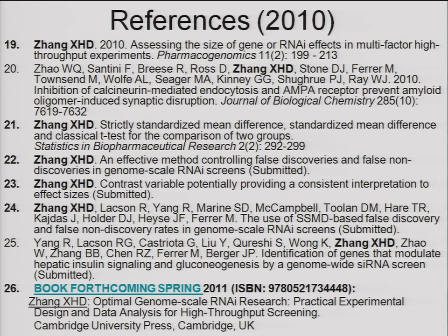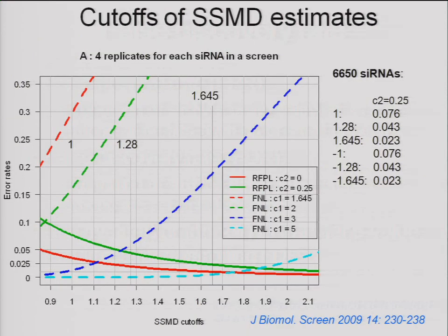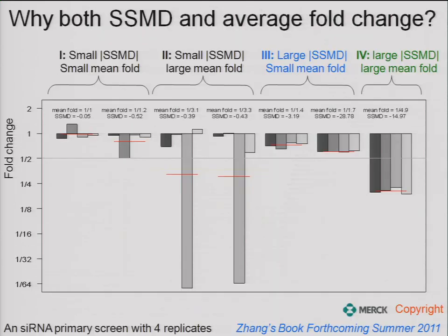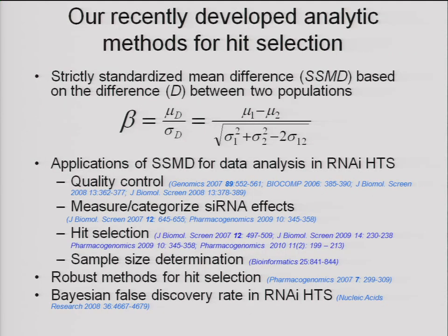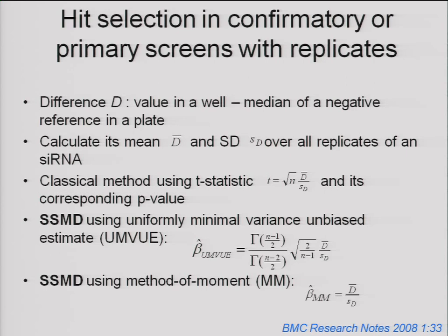So so the variability capture data variability. So if can calculate standard deviation.